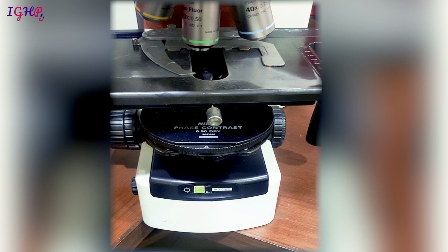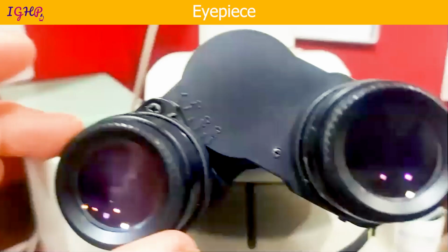So this is the stage of the microscope where we are going to put our slides, and through those slides we are going to enter into this adventurous histopathology world. So let us understand some basic parts of the microscope before we move further.